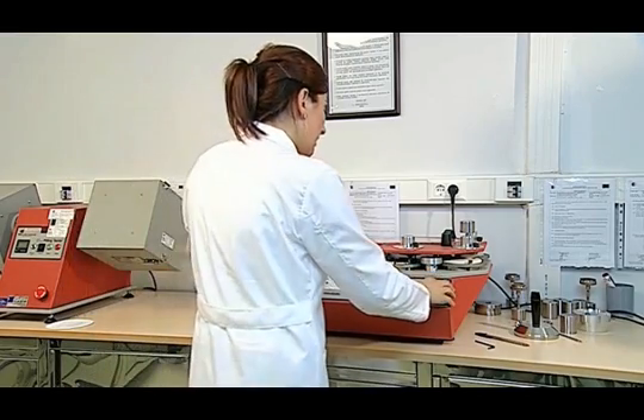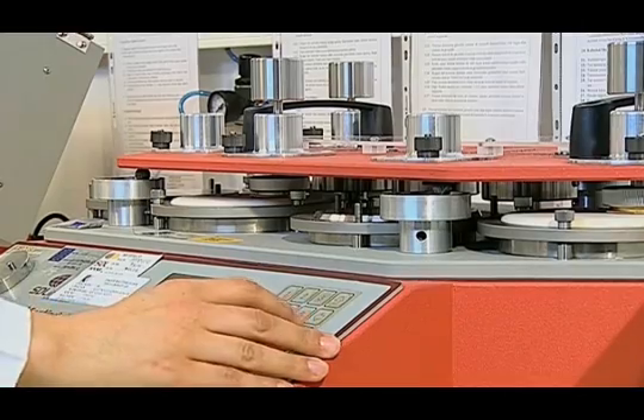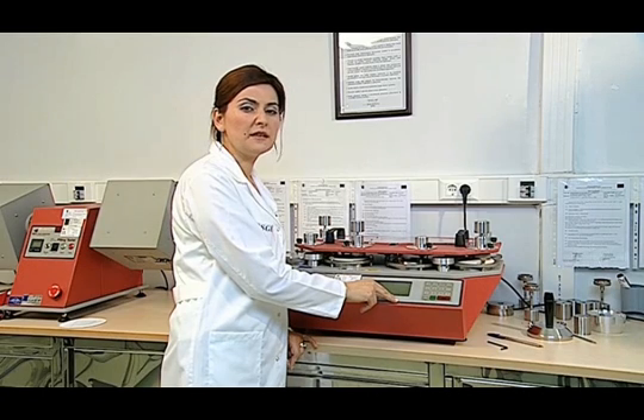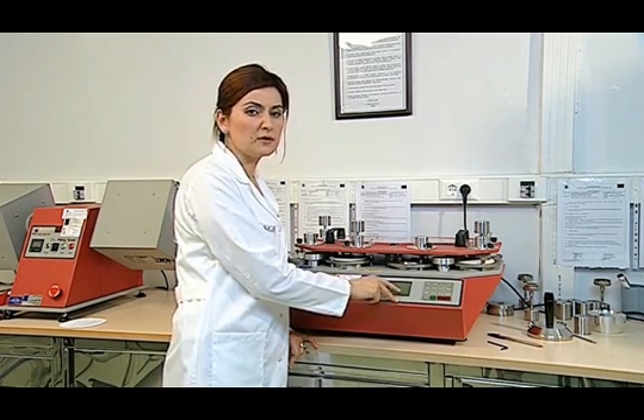We then enter the number of rubbing abrasion cycles. Resetting the value on the screen: we check the sample every 1000 cycles if the total rubbing abrasion number is up to 5000; every 2000 cycles if it is between 5000 and 20000; every 5000 cycles if it is between 20000 and 40000; and every 10000 cycles if it is higher than 40000. In cases of increased abrasion, these intervals can be more frequent.